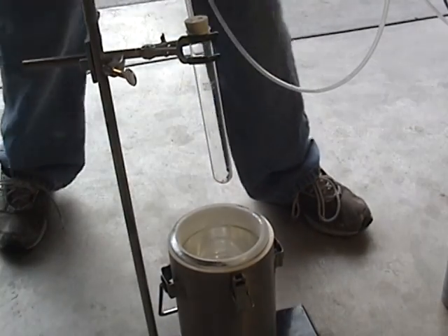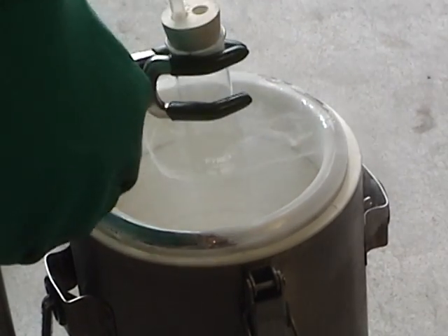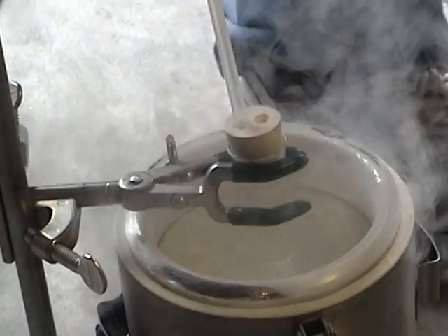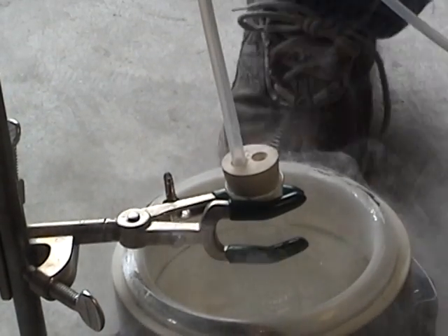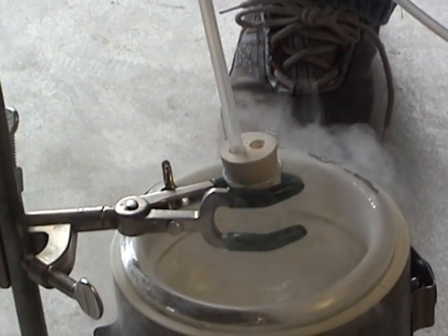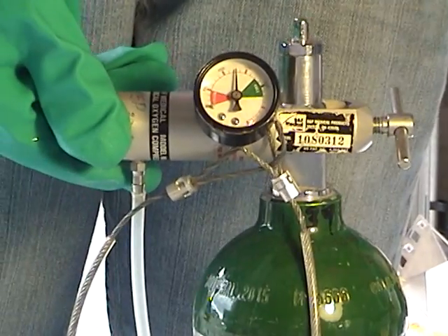I'm going to take my lid off. Liquid nitrogen's boiling point is about negative 320 degrees below zero. Now it's boiling because the test tube is warm. Liquid oxygen's boiling point is negative 297 degrees. I'm going to stop because it cooled down the test tube. I'm going to turn on my oxygen to 8 liters per minute.